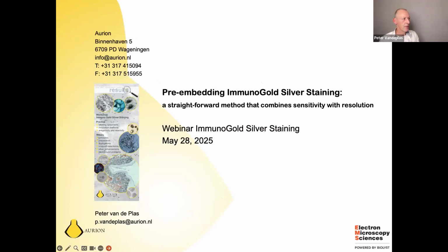Okay, in today's webinar, I will present information on pre-embedding Immuno Gold Silver Staining. What is the difference with on-section Immuno Gold Staining, a more conventional method to detect and visualize antigens on the EM level? What are the advantages of pre-embedding labeling? What are the requirements for good to decent results, both with respect to labeling density, but also morphology? And what are the limitations of the method, because they are also there.